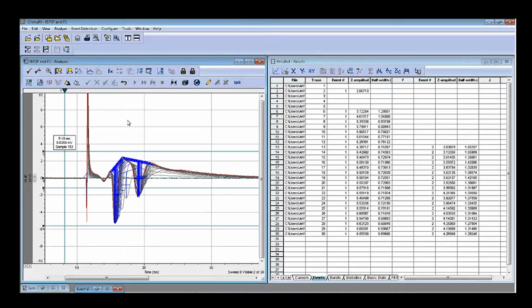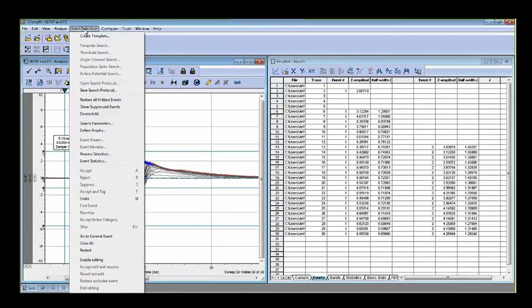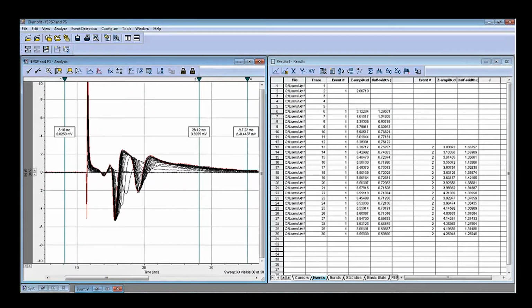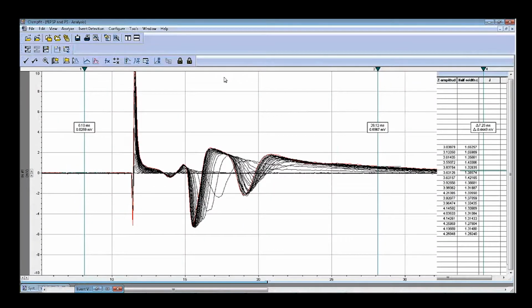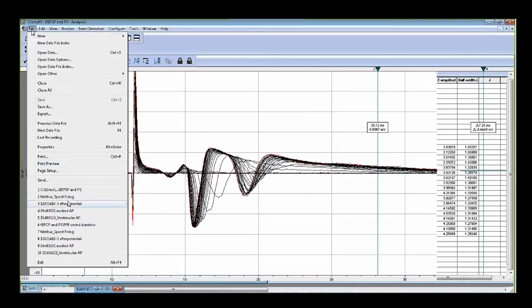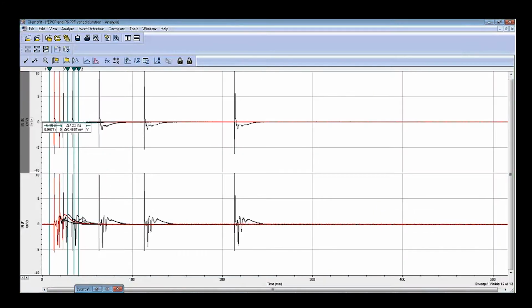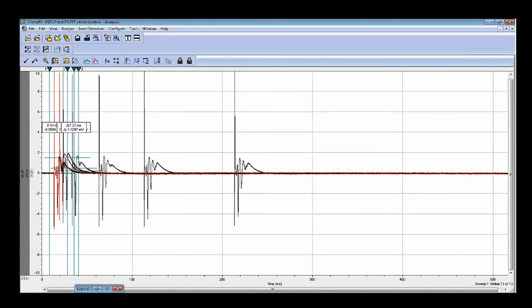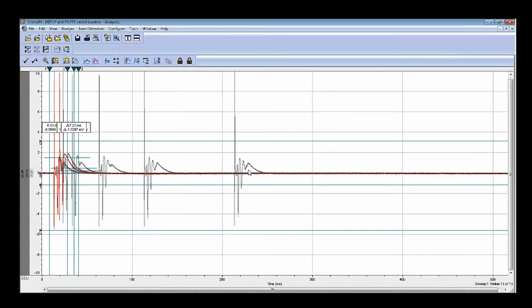Let me pick this one. Okay, now the next data I want to share with you is how we can measure the pair pulse. Okay, let me bring the data out. Is this one. We have this one. You can maximize the signal. Go to the population spike.